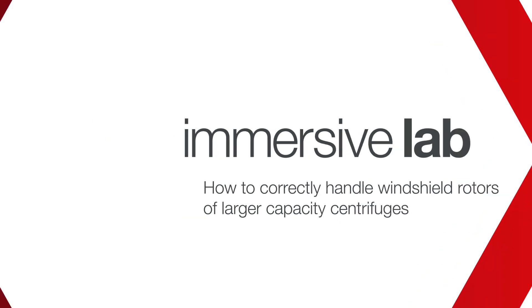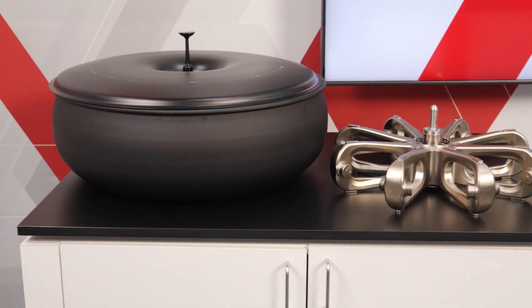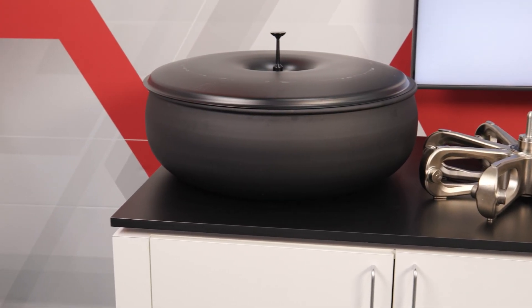In this video, we'll review how to use windshield rotors for large capacity centrifuges correctly.